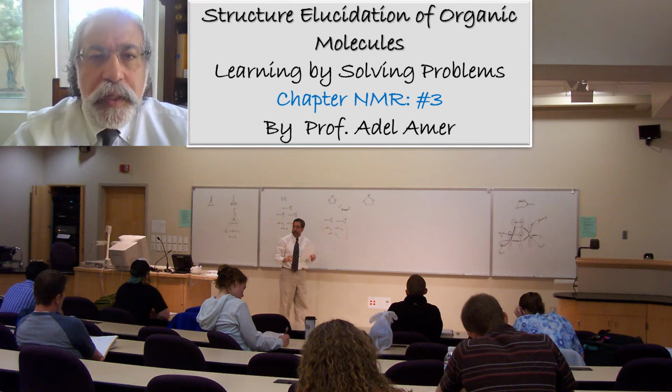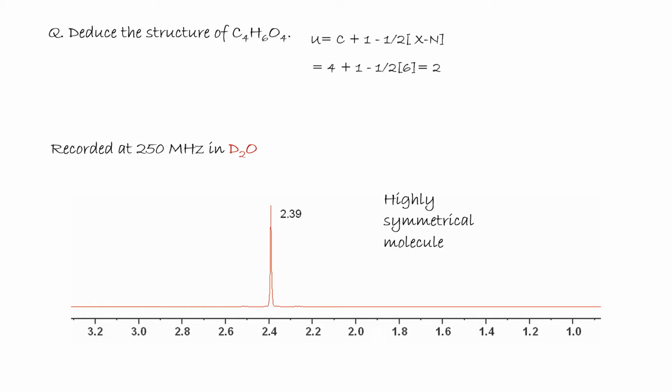Hello everyone. Welcome to Learning by Solving Problem, Session 3 on NMR, Structure Elucidation of Organic Molecule. Deduce the structure of C4H6O4, given proton NMR and carbon 13 NMR.